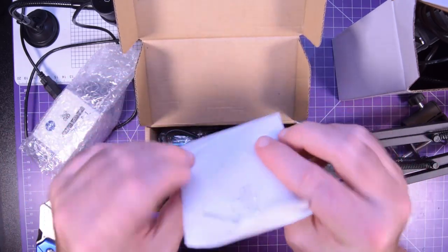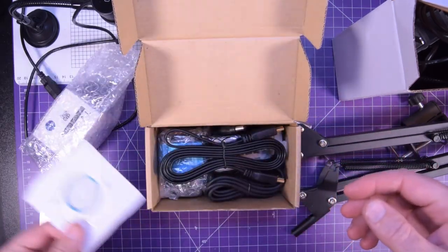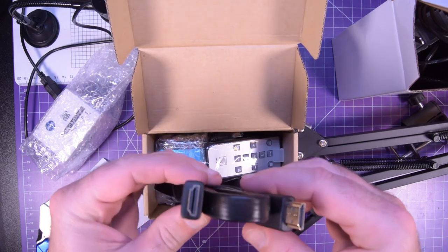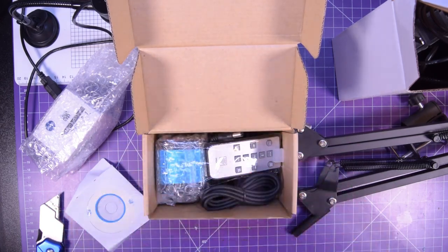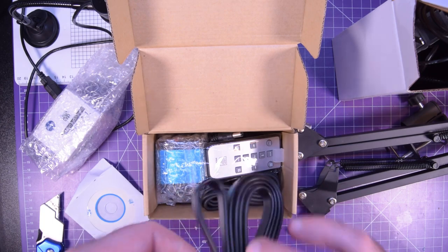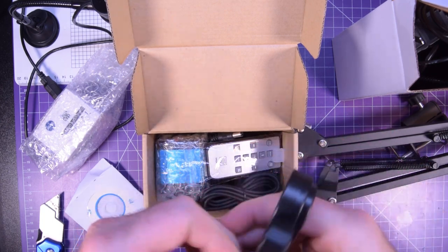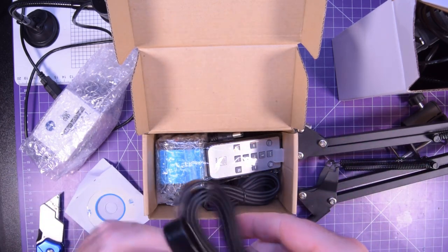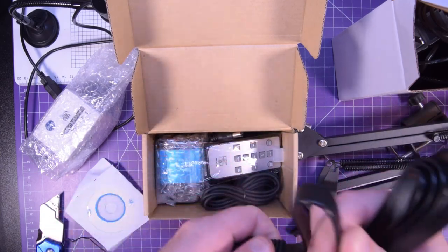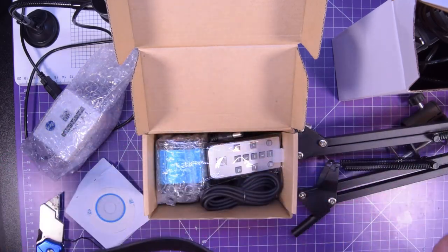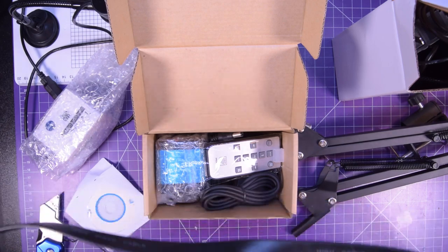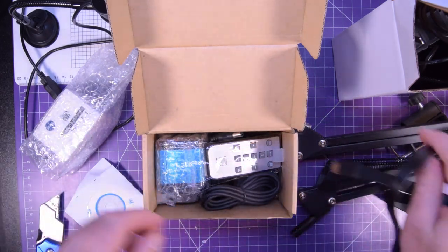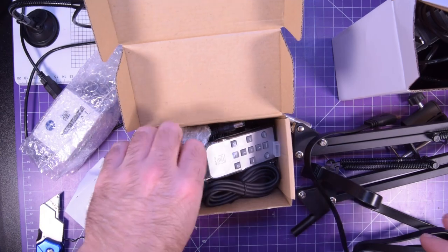Little CD. Don't have a CD-ROM drive. Ooh, it comes with an HDMI cable. Very nice. So this is a flat HDMI cable. So it's not very bulky, which is nice. Does it have good flex? It has relatively good flex. And it's pretty long. It's about probably 4 feet, a meter and a third.